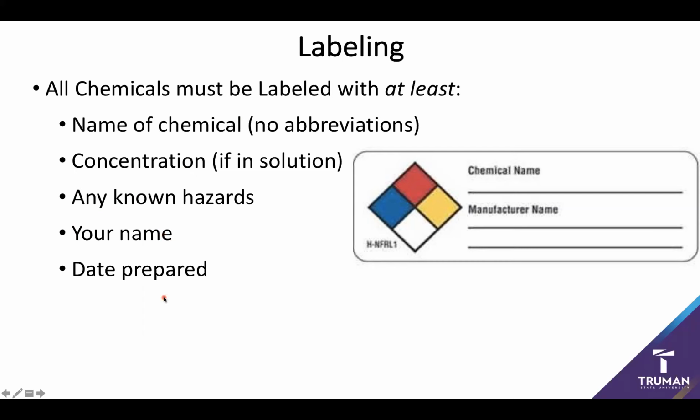And this is especially important as a lot of solutions tend to change in nature based on how long they've been stored. And so knowing how long a container has been sitting in place is a really important issue. And then make sure that you reference the notebook page where you prepped the solution. That way, in case there's any sort of special information about the preparation or notes of something that may have happened along the way, or any sort of minority species that might be present, there's a full resource available to help figure that out.